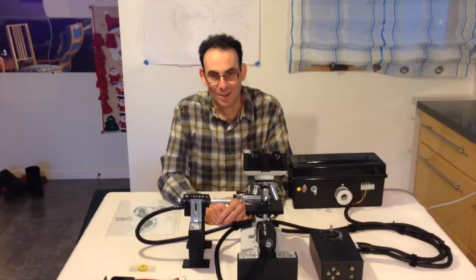We built a device that controls the motion of magnetic bacteria using electromagnets controlled by a joystick. We built everything from scratch, and that's what we're going to talk with you about next.